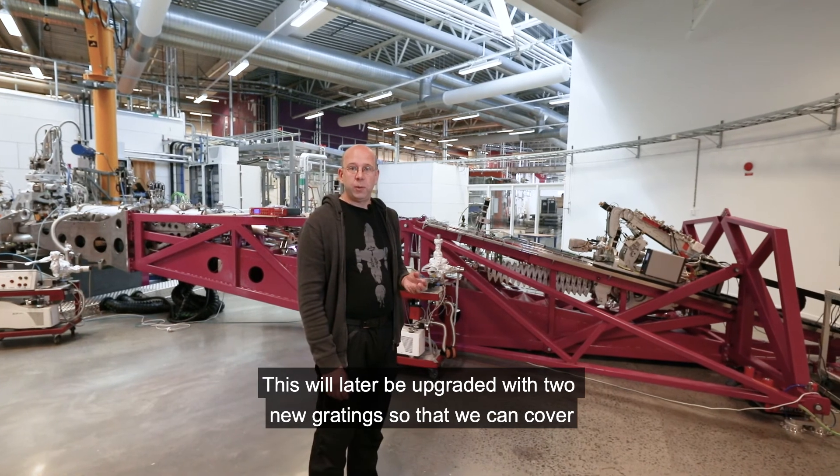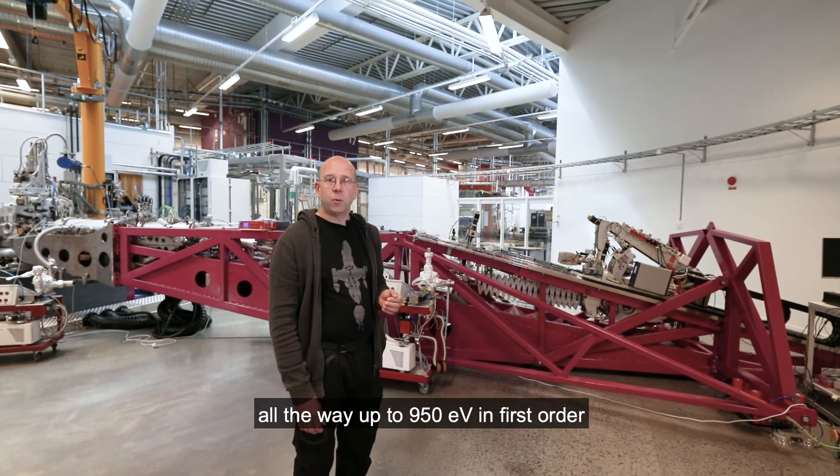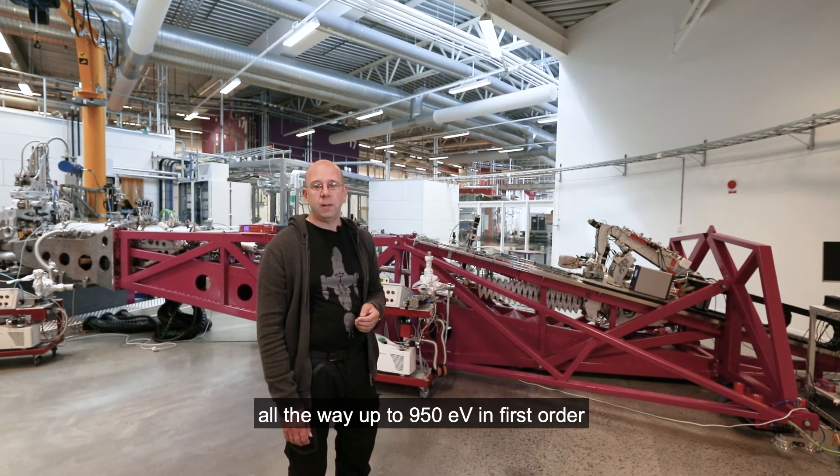500 to 1300 eV is covered with second order diffraction. This will later be upgraded with two new gratings so that we can cover all the way up to 950 eV in first order.